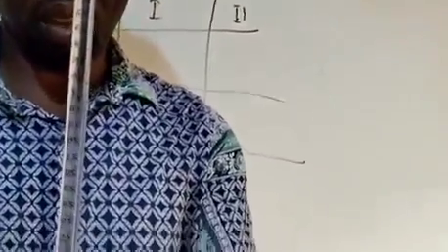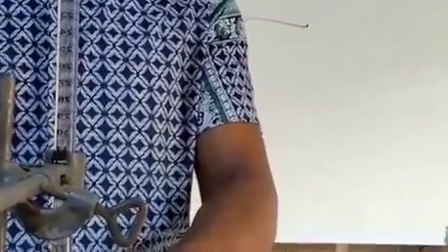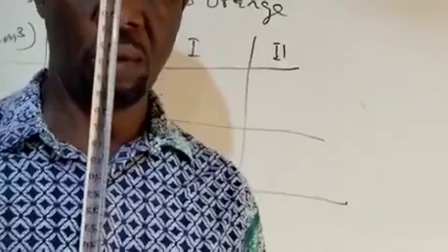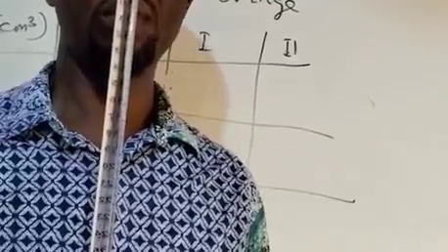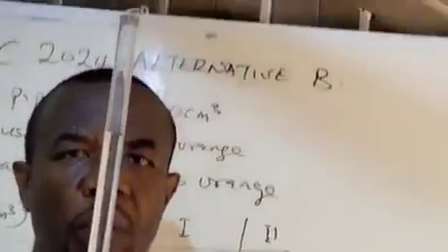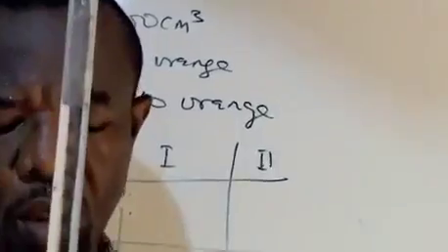Then we now open the tap to adjust the acid level to 1.0. So you see it's coming down. So gradually we can increase it as much to 1.0. So we are there at 1.0. Okay.